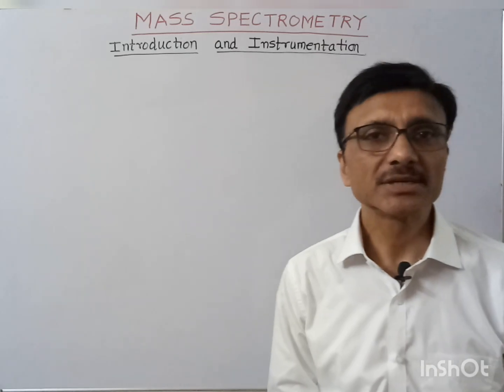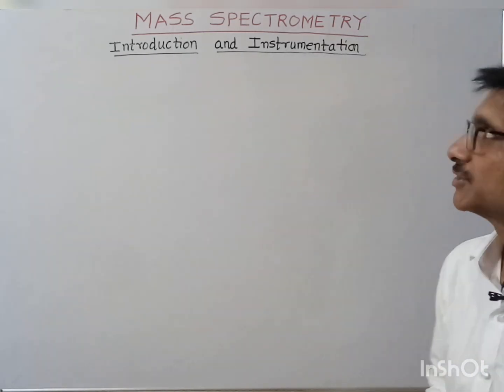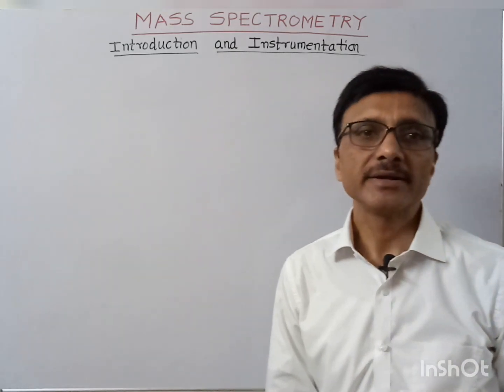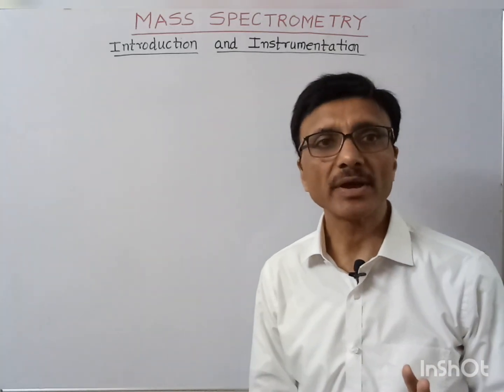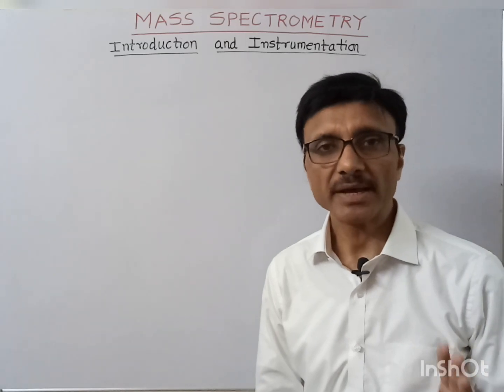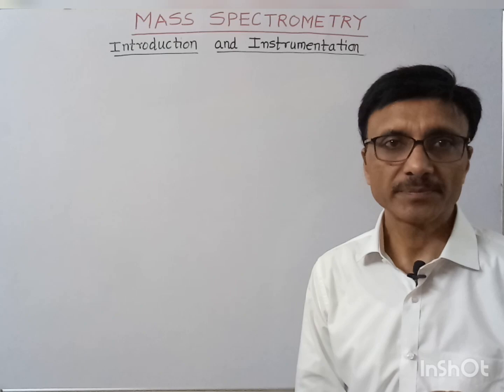In my today's lecture, I will explain the introduction and instrumentation of mass spectrometry. This is one of the analytical techniques, and it gives the information about the molecular mass of any unknown compound. So we have seen IR spectroscopy, NMR spectroscopy and UV visible spectroscopy.